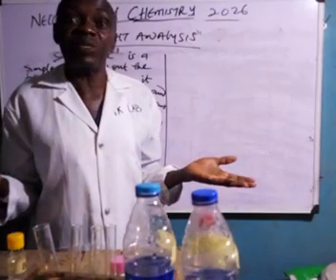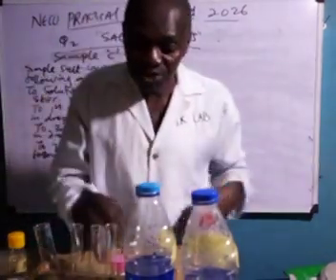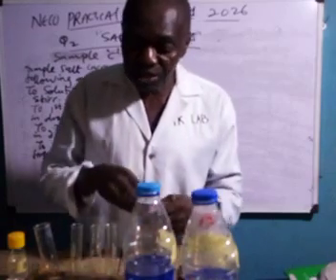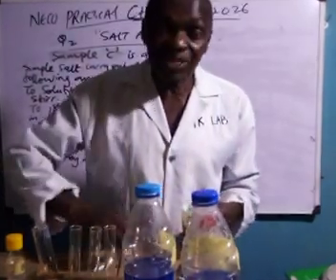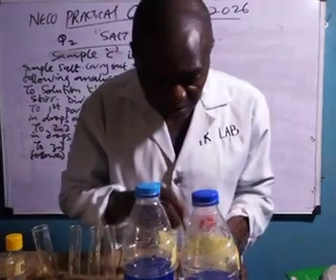Nobody has any idea about the question. It's a strong one. So that is how it is. This is my own version of it. So this is salt. I want you to have a look at it. Remember, check out all my titrations and salt analysis videos so you have a better understanding of the topic.